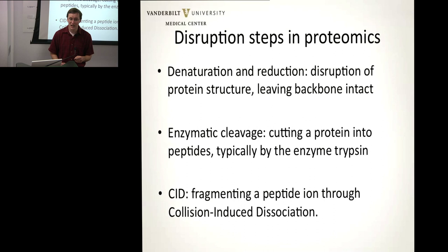And then finally, once we've got a bunch of ions of this particular peptide to deal with, we're going to undergo CID. This is the process where we're breaking apart ions of a particular peptide to get structural information. And we'll talk about those steps a little more as we move ahead.